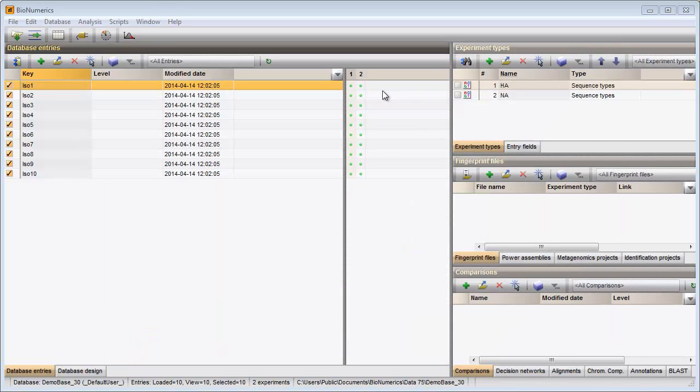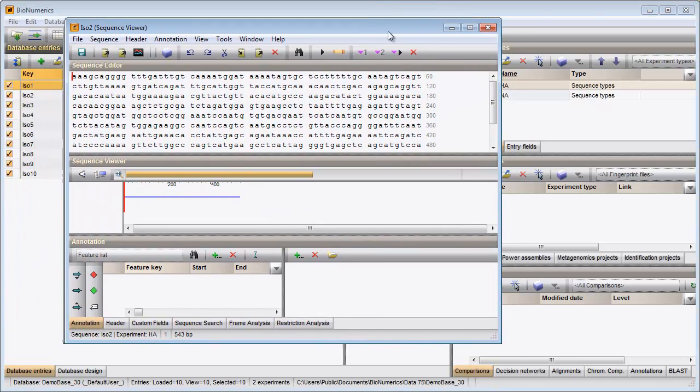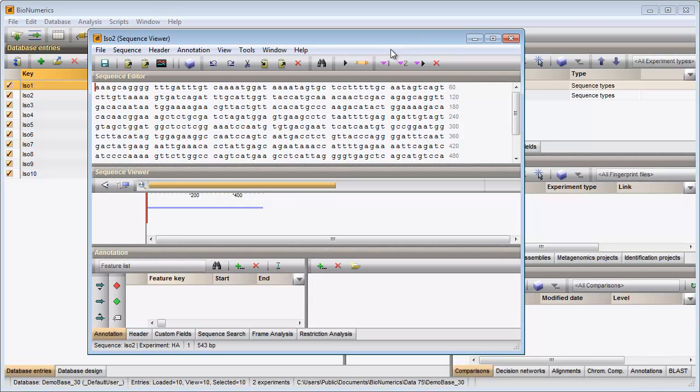The sequence editor window can be called by clicking on the colored dot. The assembly window can be called again by clicking on this button.